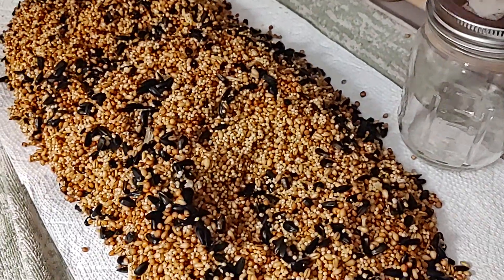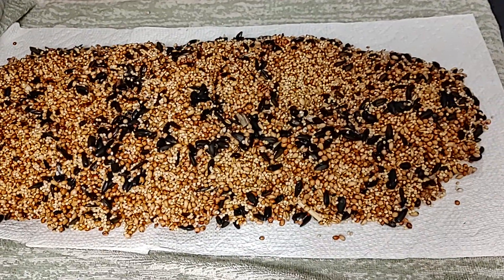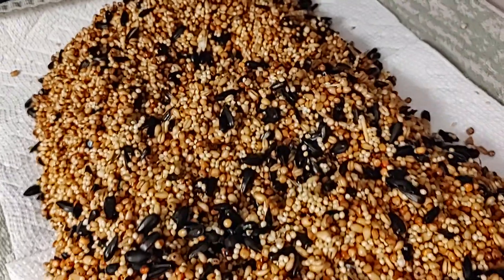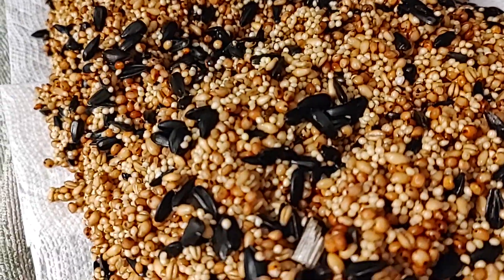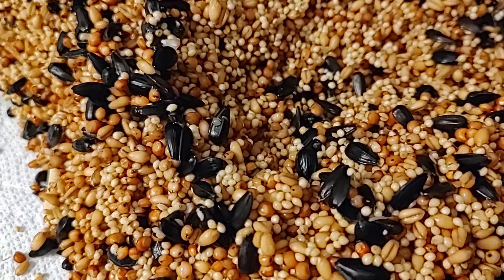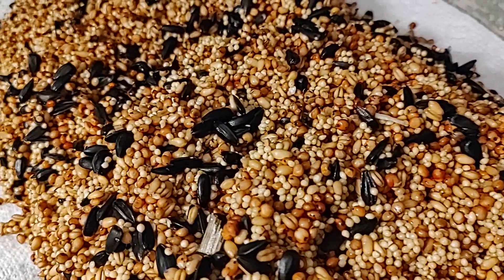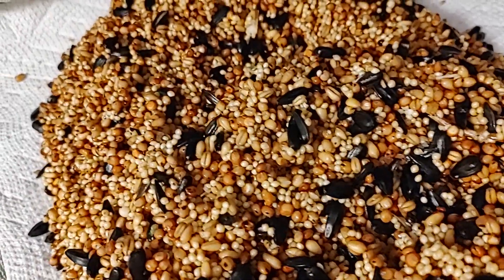This is the final step — just to show you what it looks like. We pour it out on a towel and then a paper towel. It looks really good. I wanted to show you what the birdseed looks like after a three-hour soak with three rinses. You can see how clean and hydrated it is.